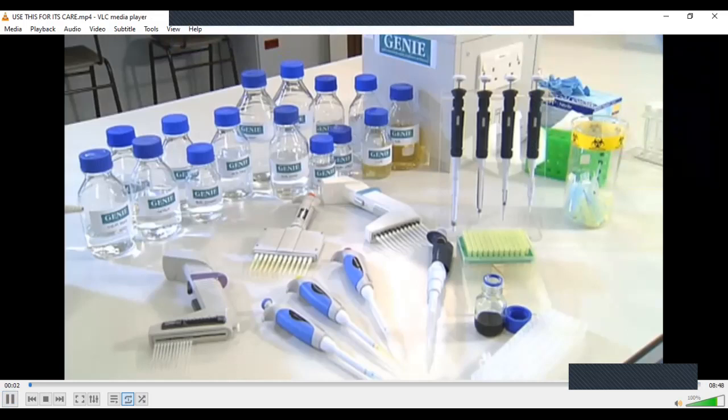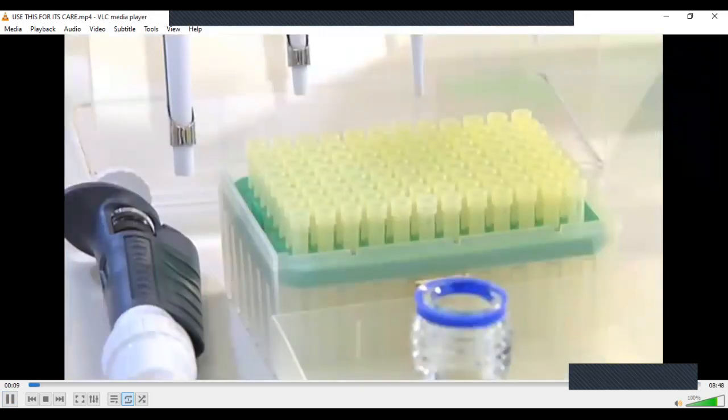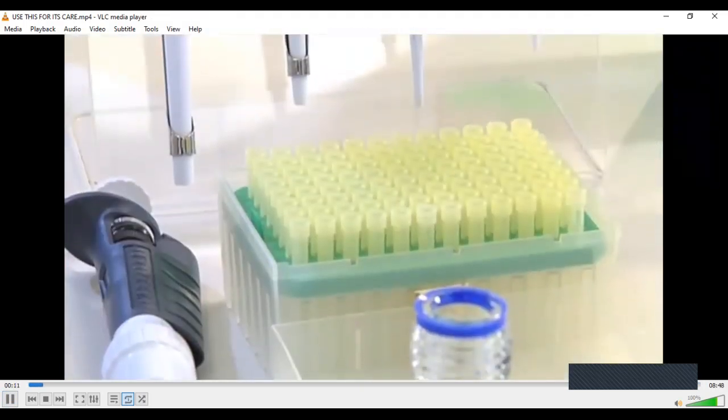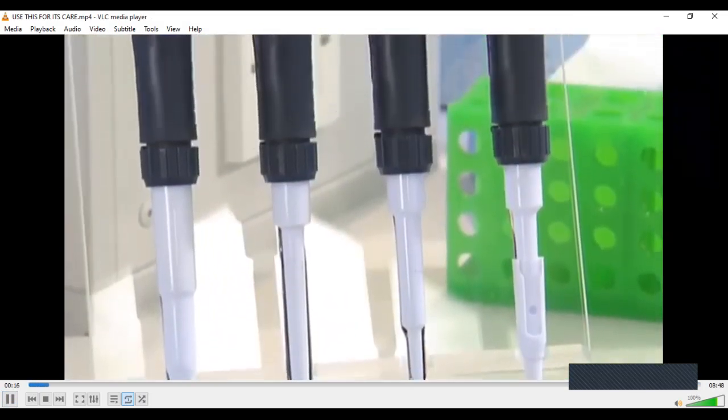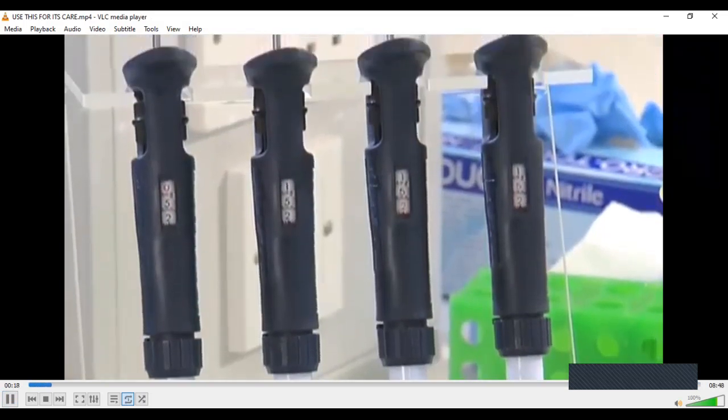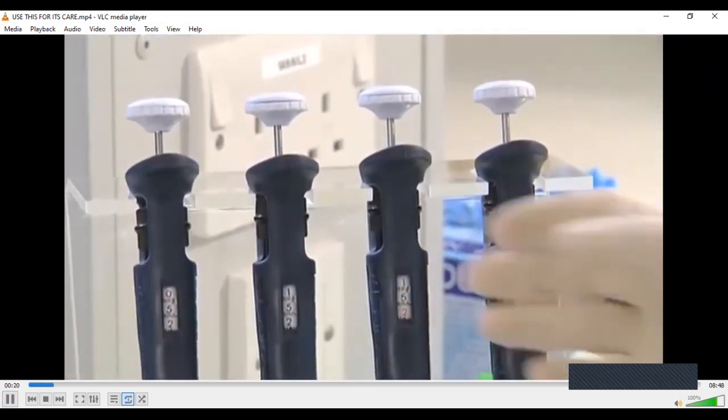Gilson or Finn micropipetters are one of the most commonly used instruments in a molecular biology laboratory. They're used in conjunction with plastic disposable pipette tips to measure or transfer small amounts of liquids, usually from 0.2 microlitres to 1,000 microlitres or 1 milliliter.